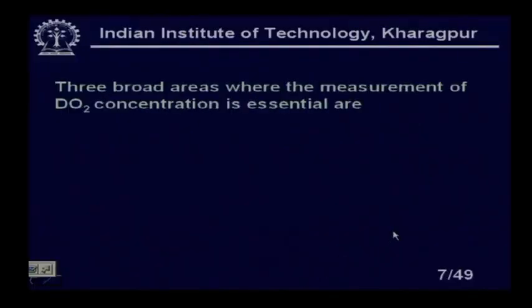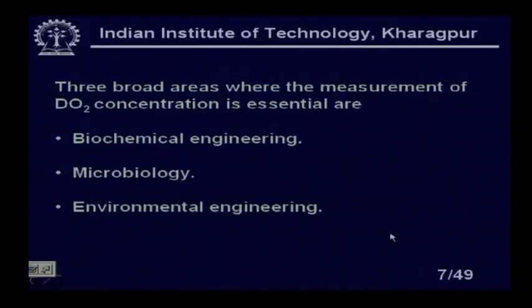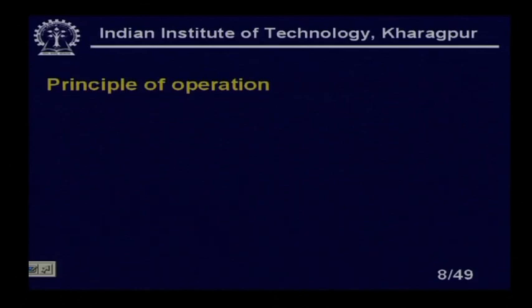Three broad areas I should say where the measurement of DO2 concentration is essential are biochemical engineering, then microbiology. Biochemical engineering obviously includes the bioreactor, microbiology, and environmental engineering, that means wastewater treatment plant and all these things. Okay. So, there also we need to measure the dissolved oxygen concentration, so the partial pressure of the oxygen in the wastewater, which is getting discharged to the environment.